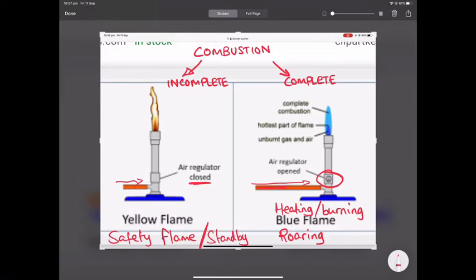And that's what you need to know basically about the two types of flame in a Bunsen burner. You need to copy this information from what I've just explained, using whatever diagrams you want from the internet. If you prefer, you could use this diagram itself. It's a little bit blurry in places, but you could use that diagram or another diagram of your choice of the Bunsen burner, and an explanation according to what I just said. You need to transfer that into your notes.